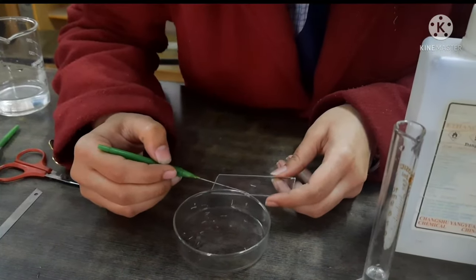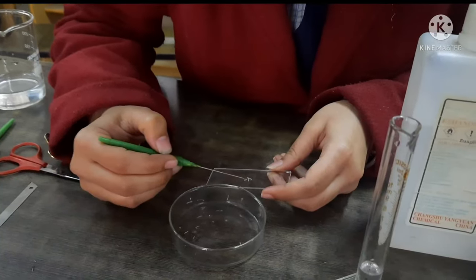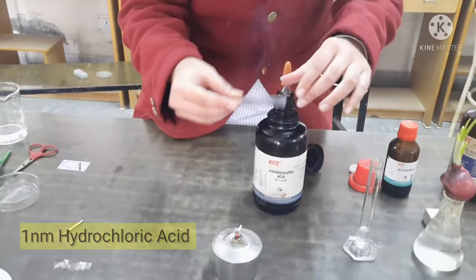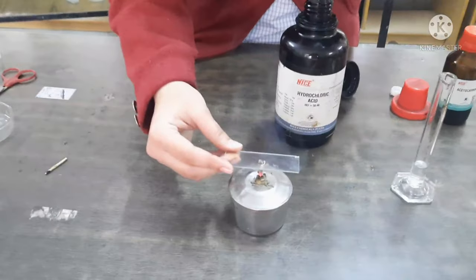Take 2-3 root tips on a slide. Add a drop of N hydrochloric acid (HCl) and warm the slide gently on a flame like this.